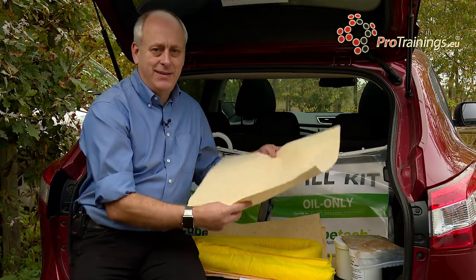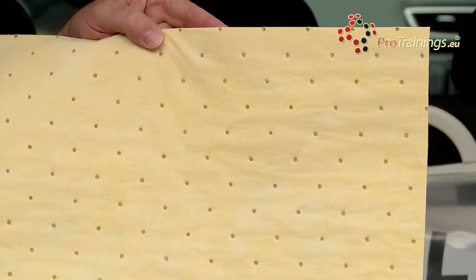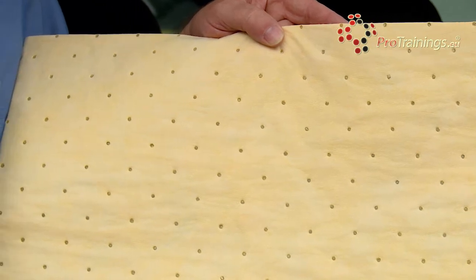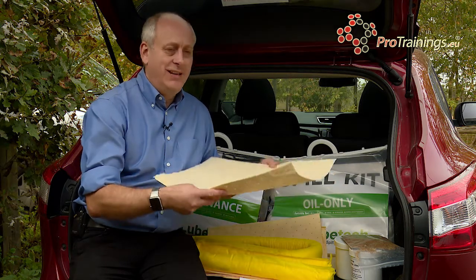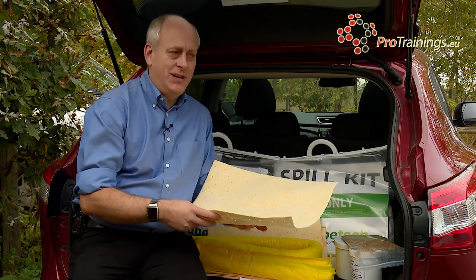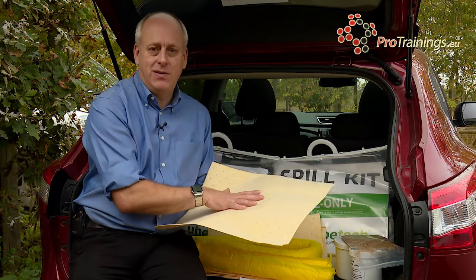The next part is the mats. These mats come in different shapes. This is the chemical one, and you would place it down onto a chemical spill. So if there is a small chemical spill, you can literally lay this down and the mat is specially designed to absorb the chemical into the substance. Once you have contained the chemical, you need to pick it up — you can use shovels or brooms, but then you need to dispose of it correctly.